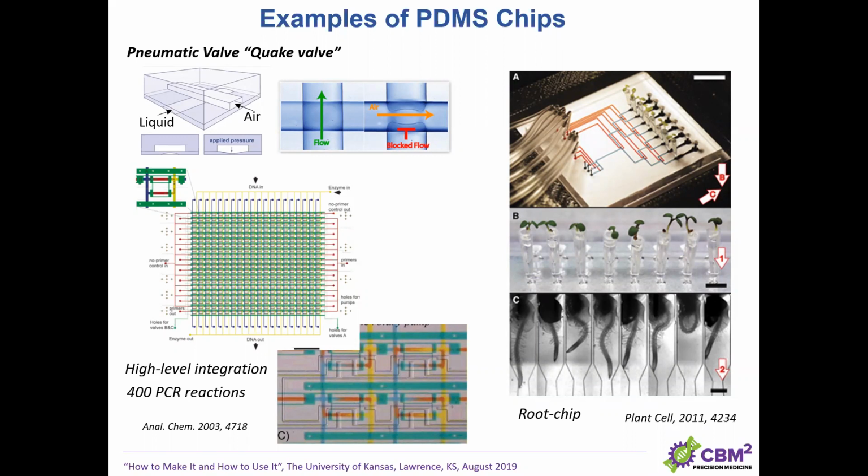Okay. What kind of pressures can you apply to this material? PSI. So that's a good question. It's probably even below a PSI or a couple of PSIs. For the material itself, you have silicone, which is PDMS tubing in medical applications. You can apply a couple of PSIs, but here it will all depend, and those valves would all depend, on the thickness of the membrane and what channels you want to close. But it's definitely not a high pressure material.